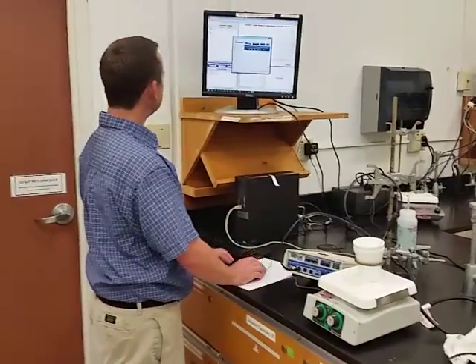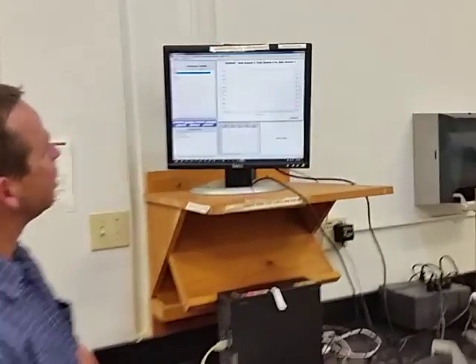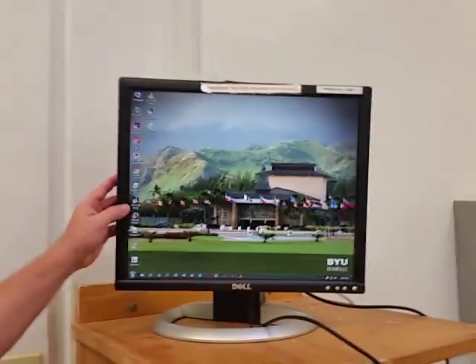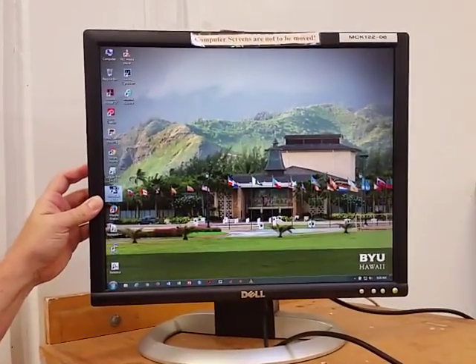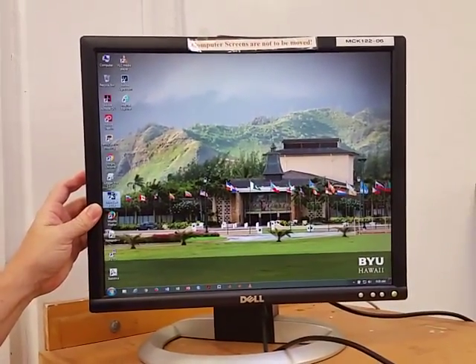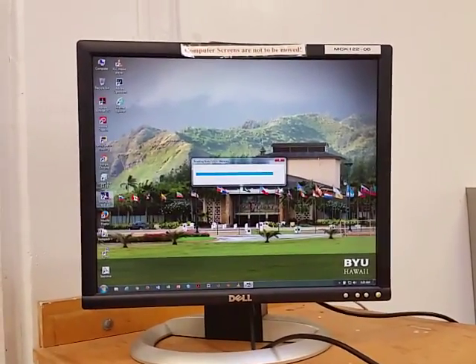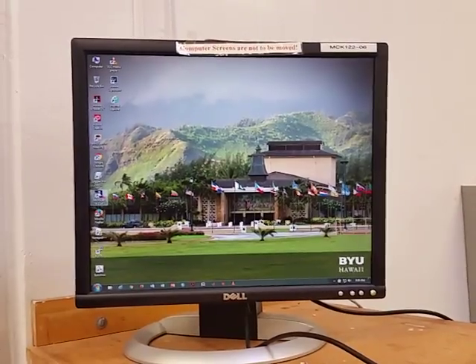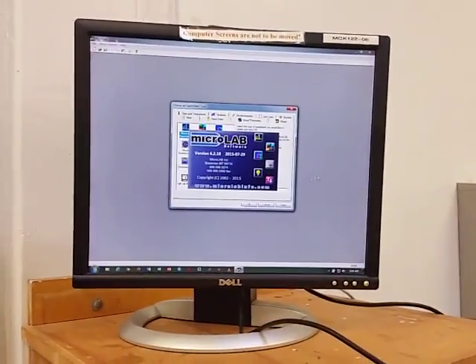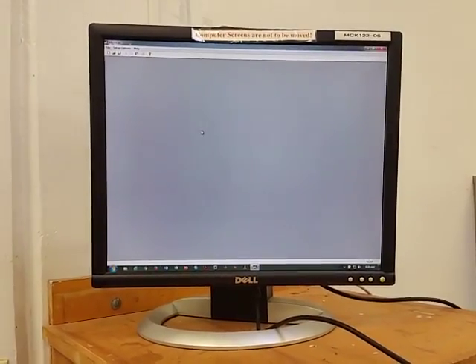Then I can go into the, I'll just close this just so we can show people from the beginning. Right here, Microlab is where we're starting. Double clicking there. And I have to make sure I see that thing. If I don't see that thing, then it'll make me think I've opened the software and I'll work on something that's not actually there. All right. So, Microlab, double click there.